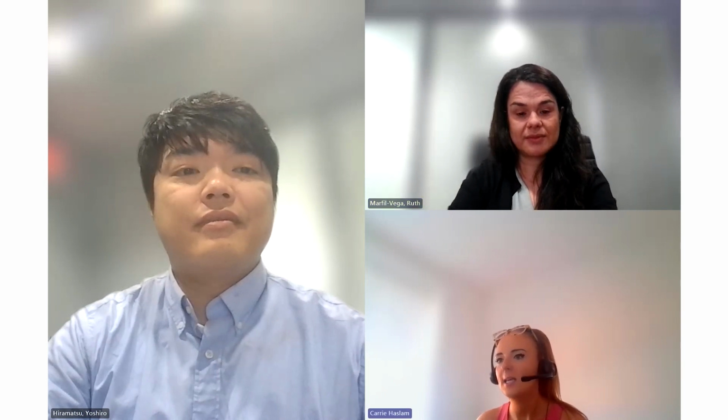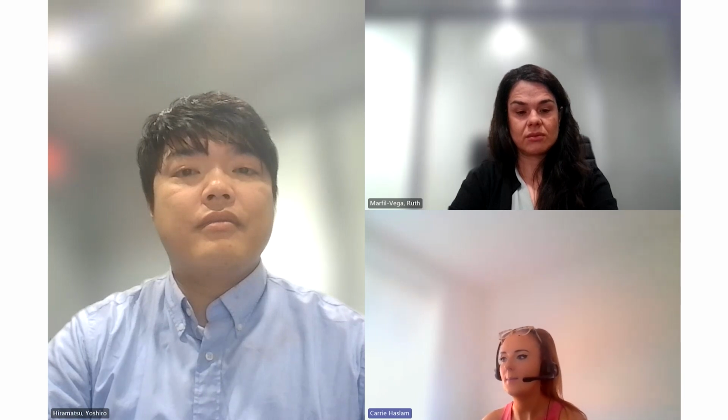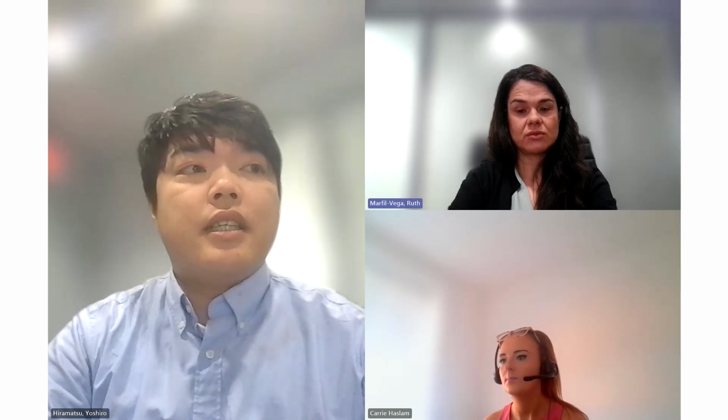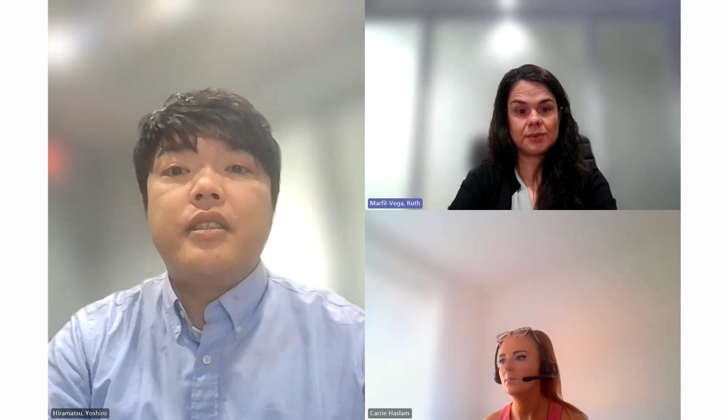Perfect, thank you. Another question here is, is the data processing software mentioned in the webinar used for other instruments like GCMS/MS or LCMS/MS? Yes, definitely. The Lab Solutions Insight which I introduced in the webinar is especially for MS data processing.